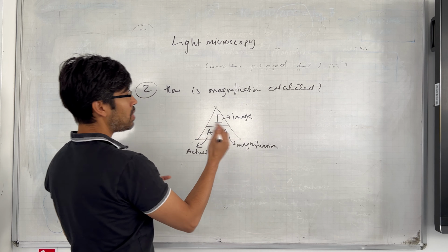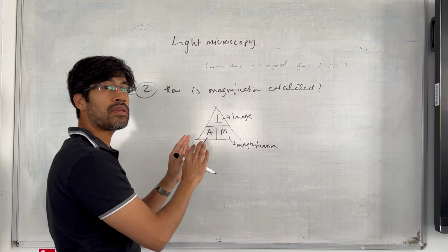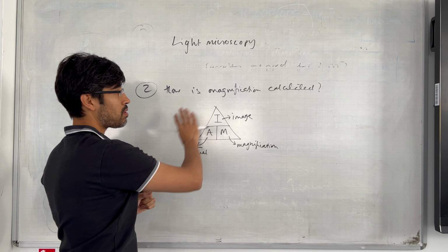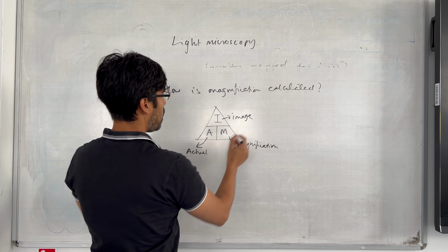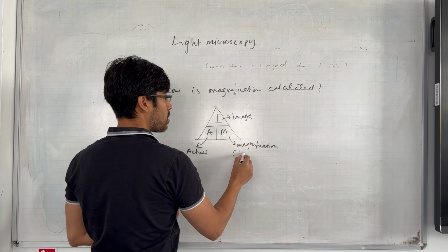Okay, but I think too many students do get this and then they're just relying on this, like, I can deal with it when I get the question. Rather, you need to make routines to make this knowledge more effective for you. Okay, so magnification should be a large number.